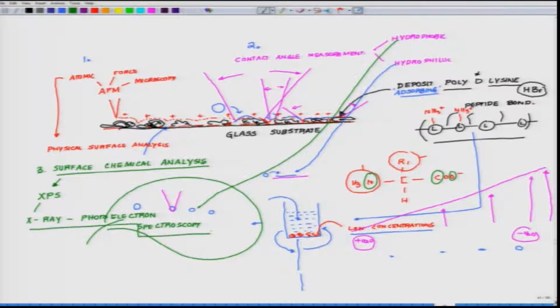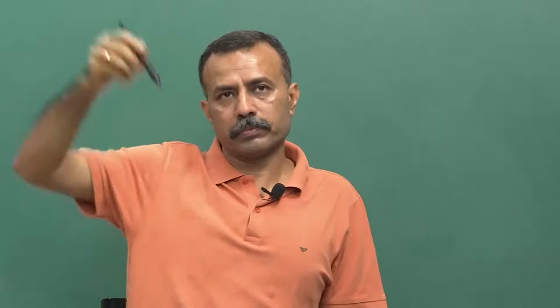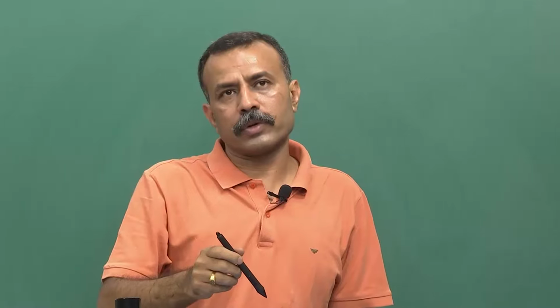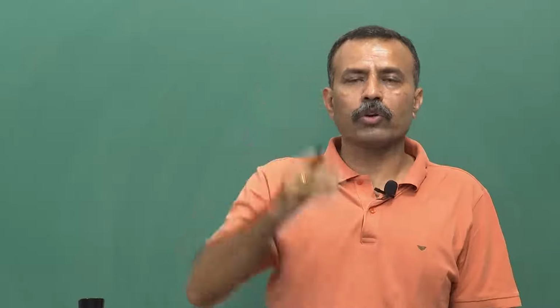This is one form of spectroscopy where, in simple language, you shine radiant energy on the substrate, only at a certain level, you do not go very high on it.